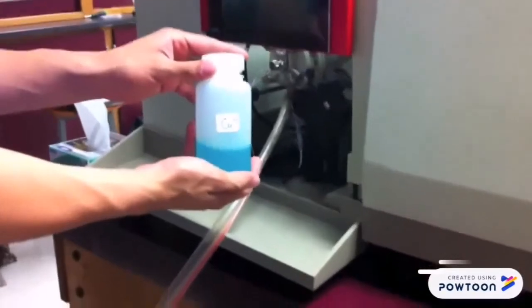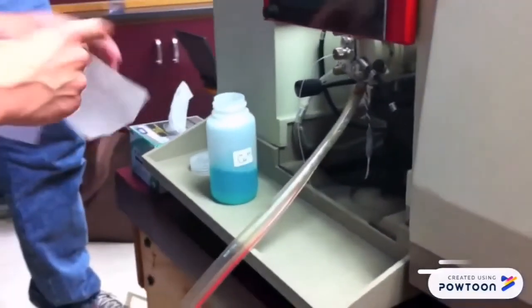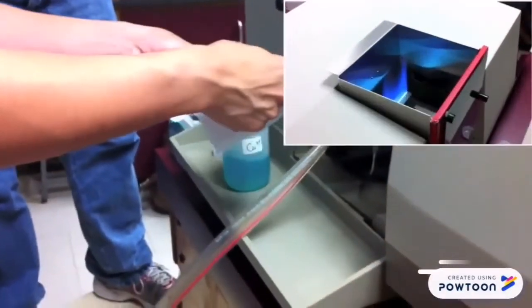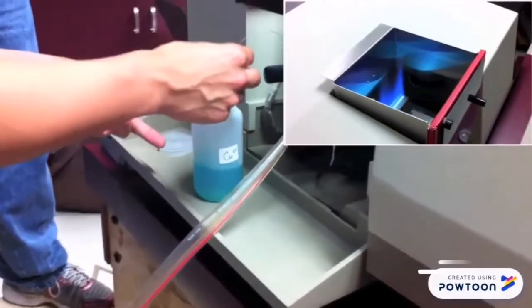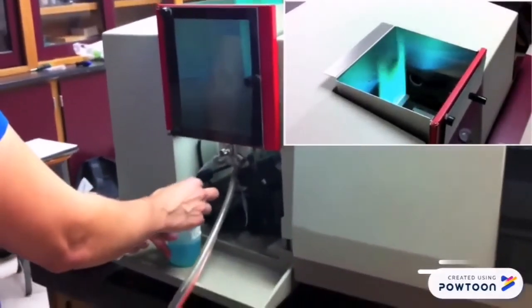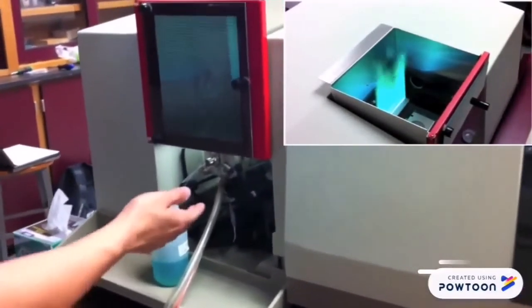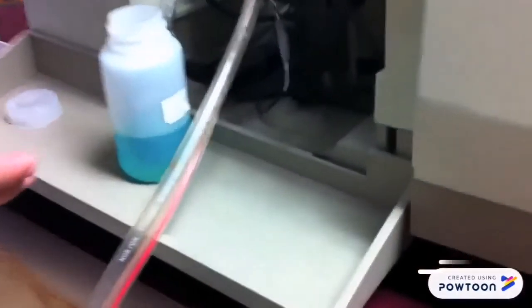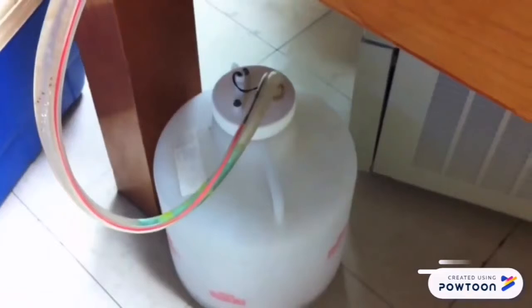This demonstration will use a sample of copper. First, start by cleaning the sample capillary with a chemical wipe. Then, insert it back to be aerosolized, mixed with gases and released into the flame. The flame turns a green color that is distinctive of copper. Waste is then siphoned off into a collection bucket. The data is then sent to the computer for analysis.